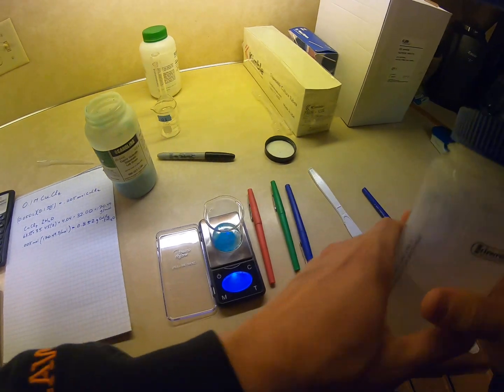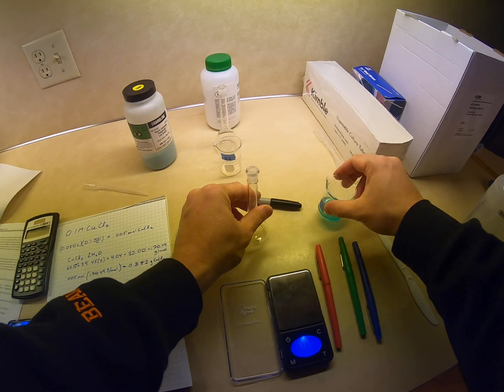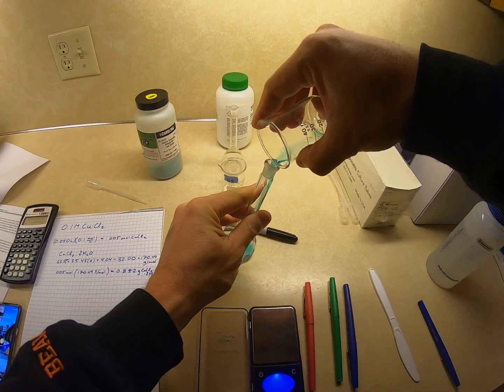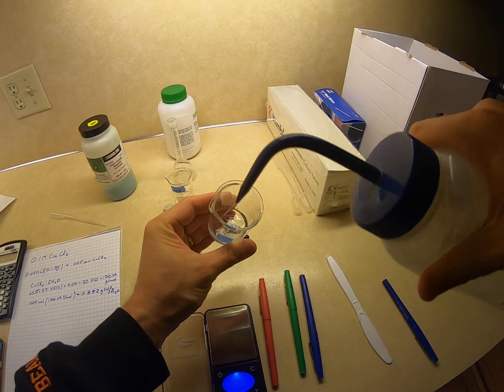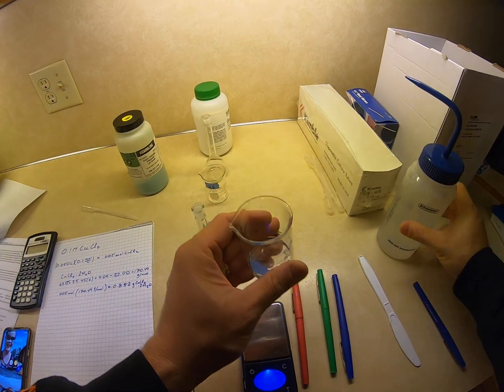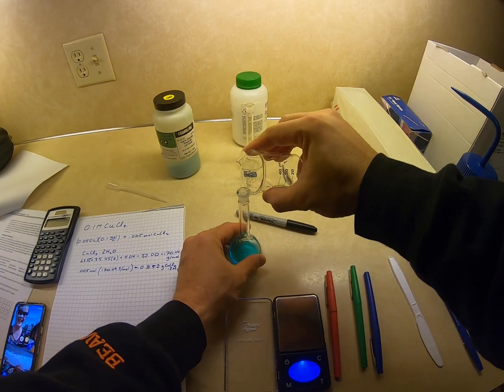Okay, then to help this, I'm going to dissolve it slightly. I'm going to be careful to transfer all of the copper chloride. Now you'll notice I just partially dissolved it. I'm just rinsing down the sides, trying to transfer all the copper chloride. Okay, I think this beaker has been rinsed well enough.